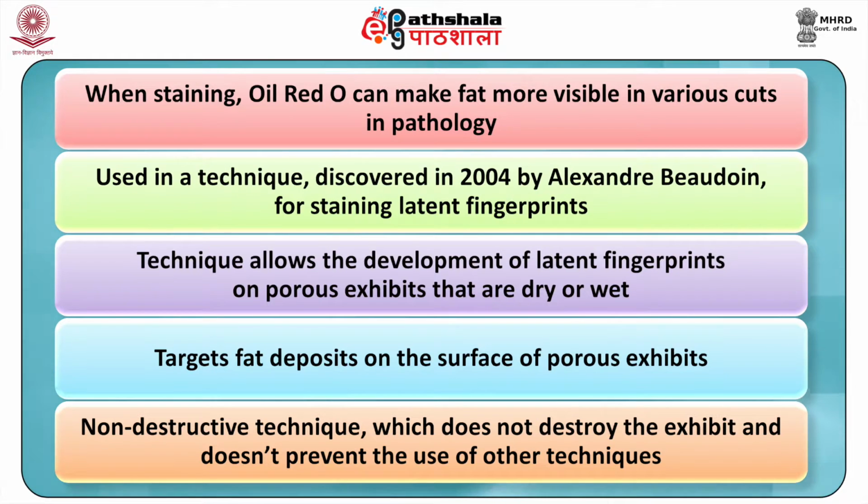The method, called the dye oil red O, was discovered in 2004 by Alexandre Boudouin for staining latent fingerprints. This technique allows the development of latent fingerprints on porous exhibits such as paper, cardboard, etc., that are dry or wet.